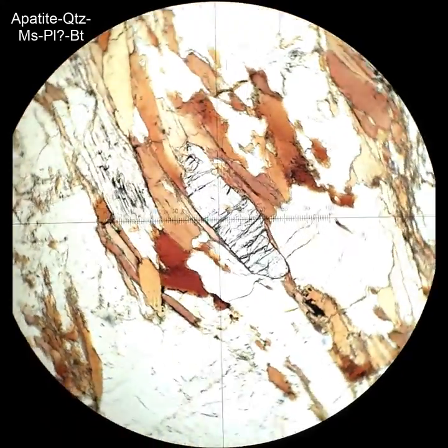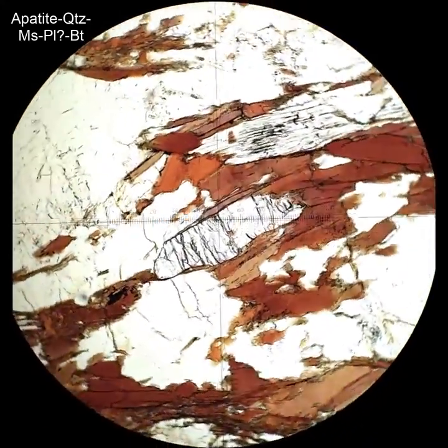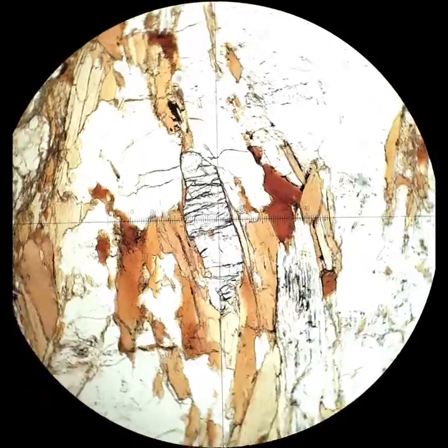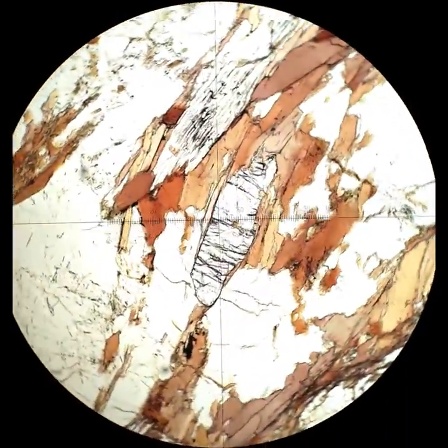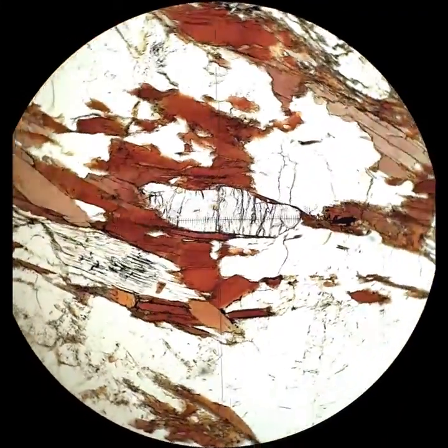This is also characteristic of apatite. This is where the long axis is in the plane of the thin section. They tend to get these fractures that run through them. They tend to be sort of barrel-shaped rather than prism-shaped, and here you cross the polars, and you can see that really is as bright as it ever gets in cross-polars.